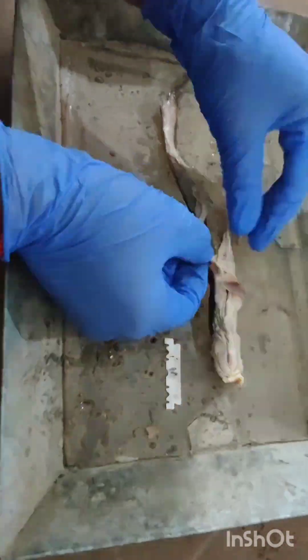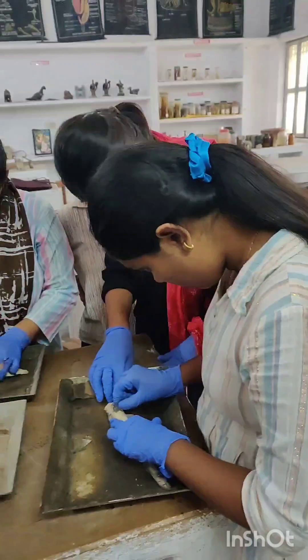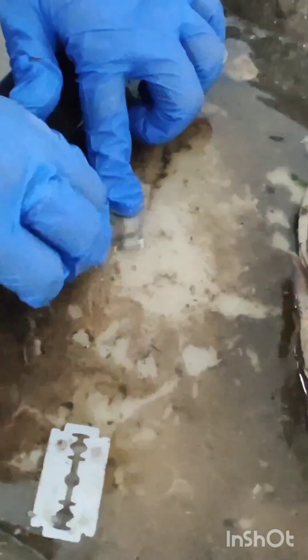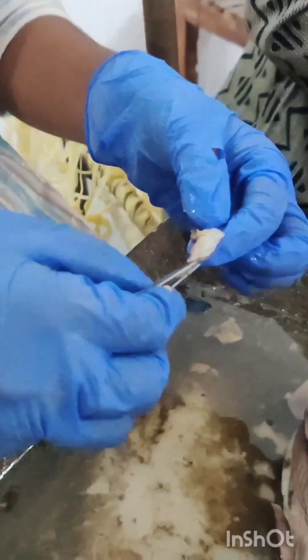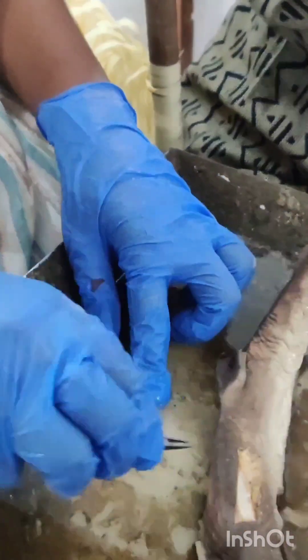Today we will dissect Scolidon, commonly called dogfish. Cut the skin of the fish gently and remove the excess muscles. Carefully remove all the excess material except the skin.